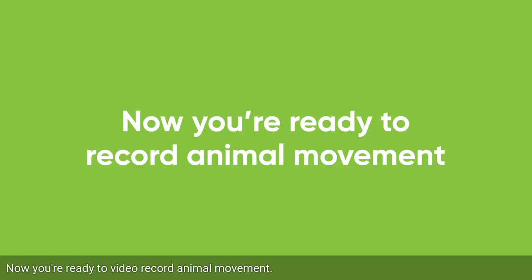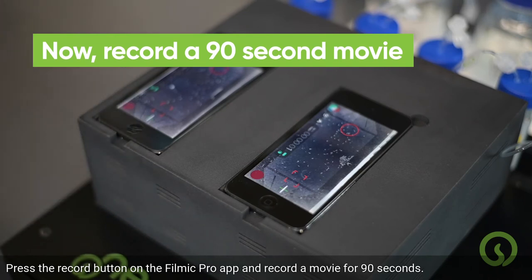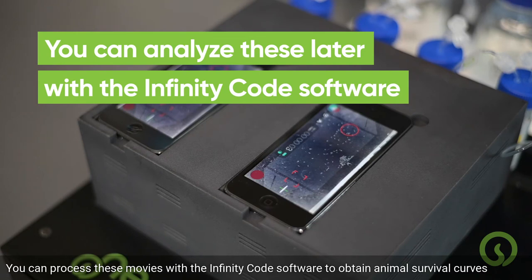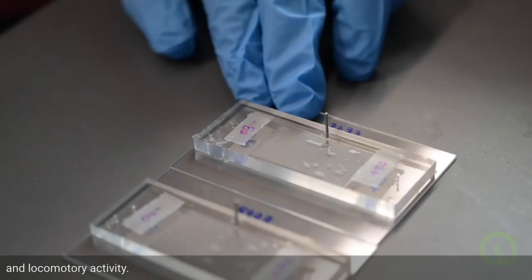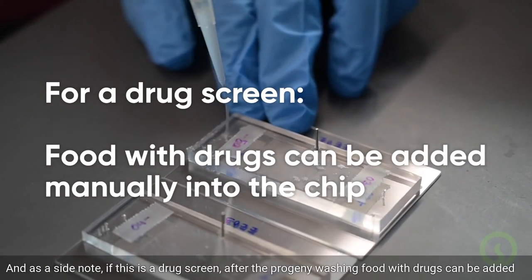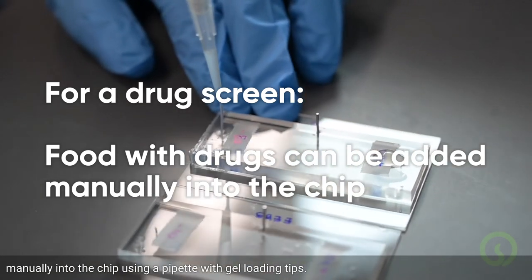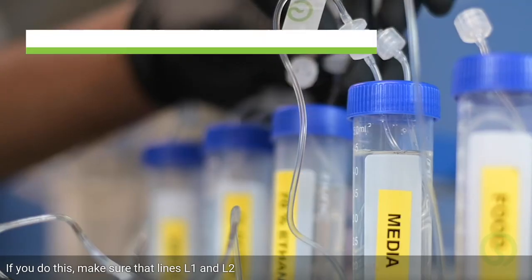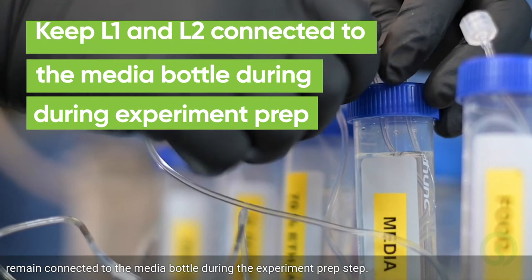Now you're ready to video record animal movement. Press the record button on the FiLMiC Pro app and record a movie for 90 seconds. You can process these movies with the Infinity Code software to obtain animal survival curves and locomotor reactivity. As a side note, if this is a drug screen, after the progeny washing, food with drugs can be added manually into the chip using a pipette with gel-loading tips. If you do this, make sure that lines L1 and L2 remain connected to the media bottle during the experiment prep step.